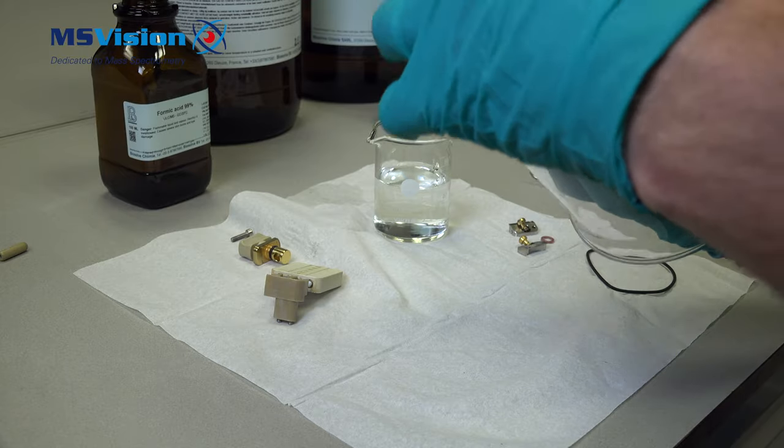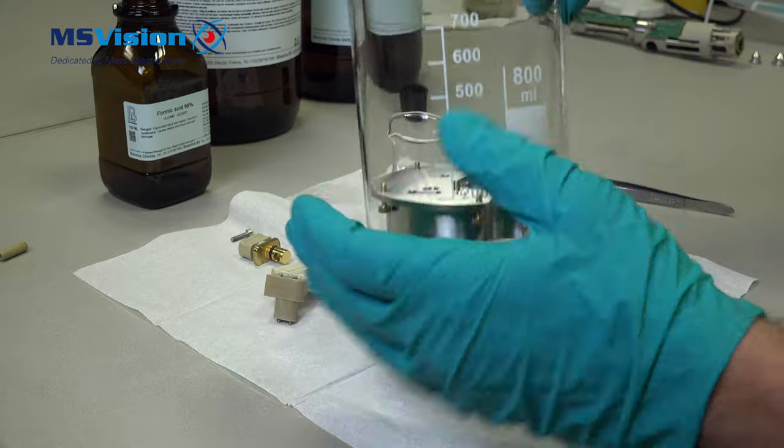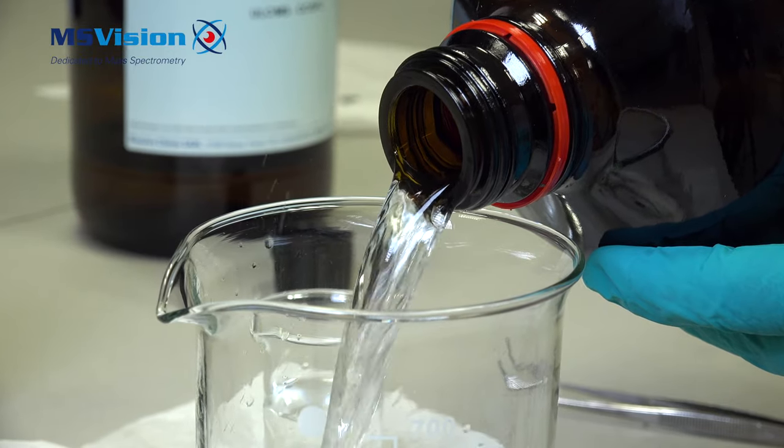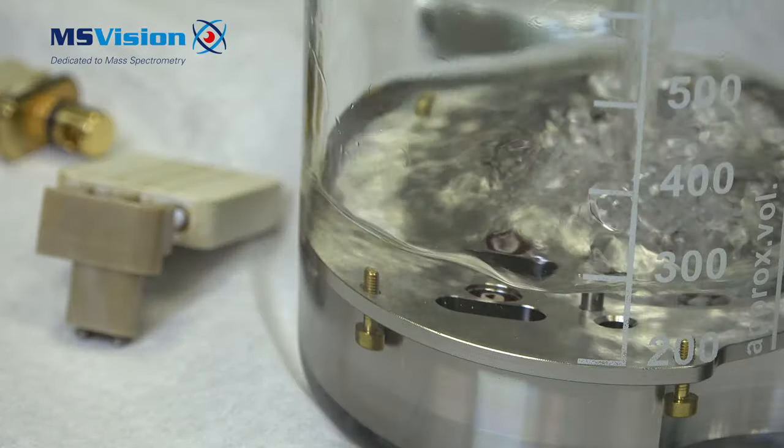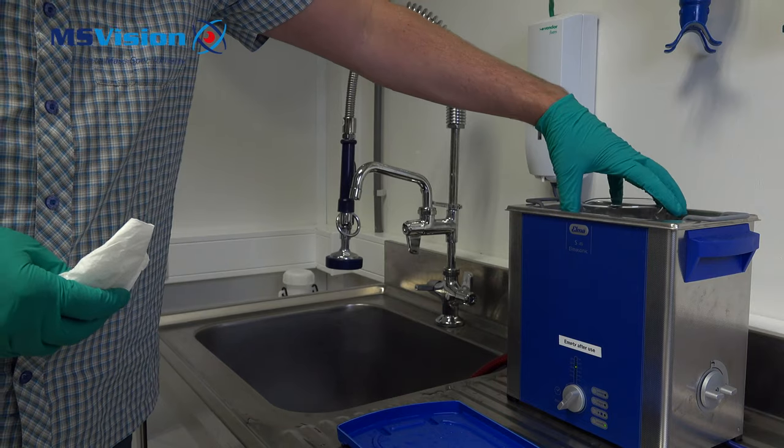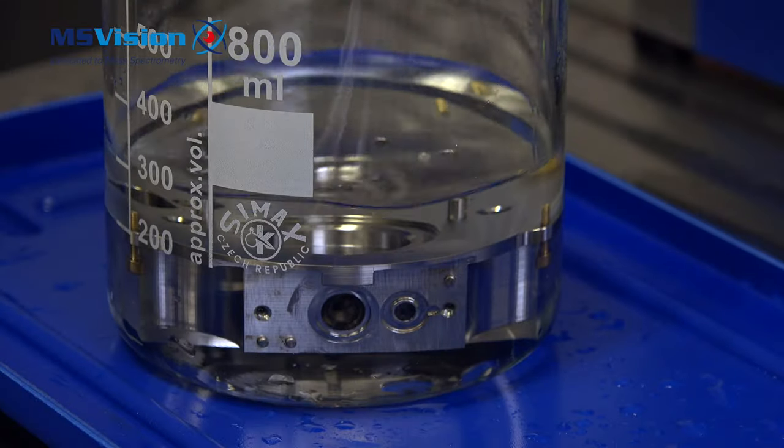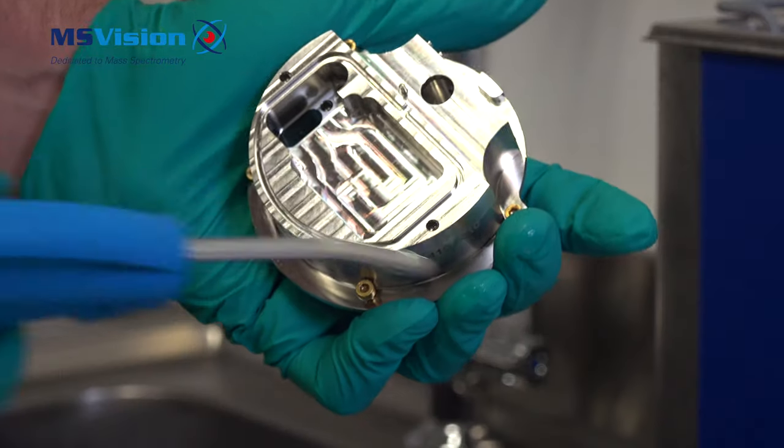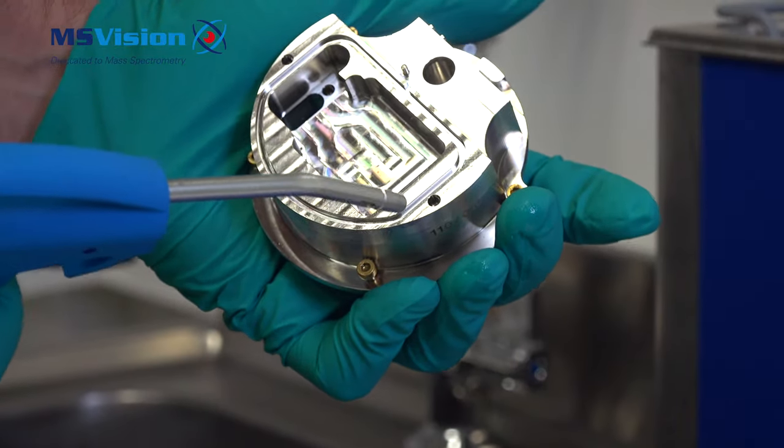The final step is to take out the glass beaker. Dry quickly using nitrogen to prevent methanol spots from forming.